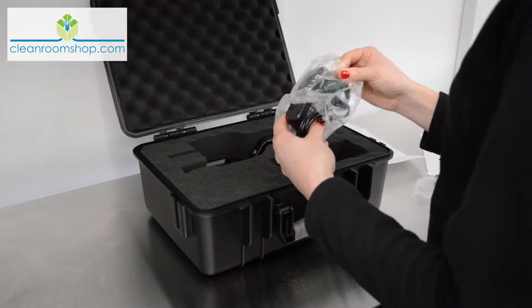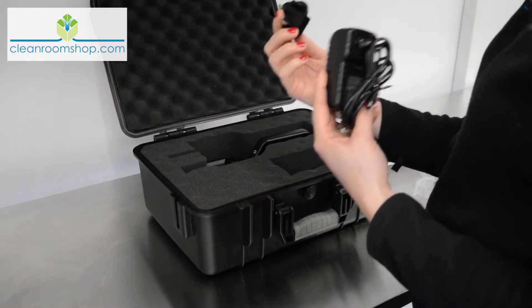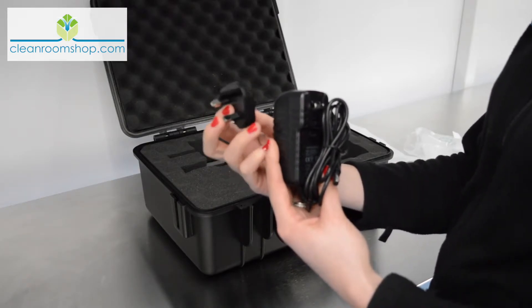Here's a charger. This is designed to accept different adapters for different countries. Clean Room Shop supplies the units with the UK version, but Euro and American versions are also available.